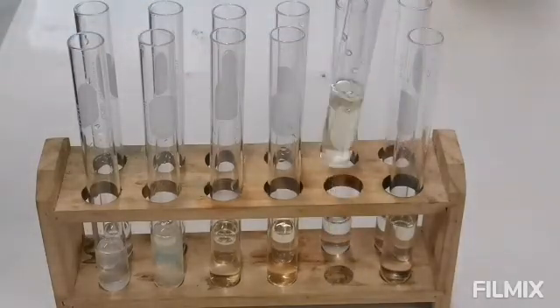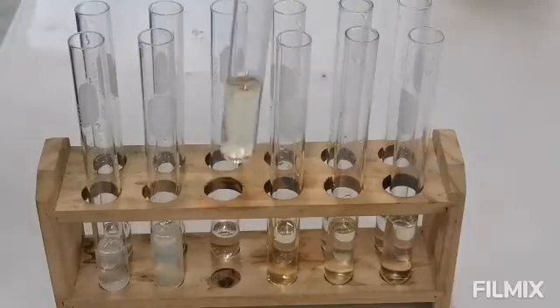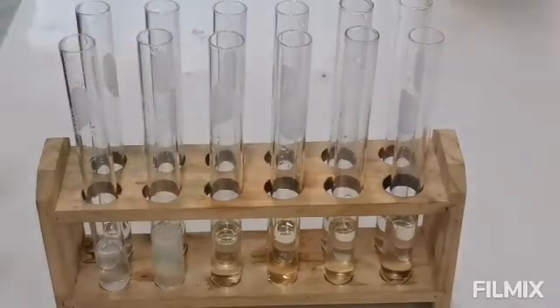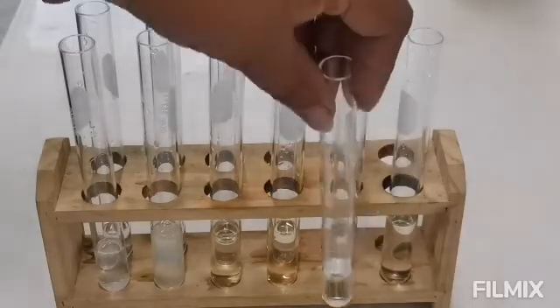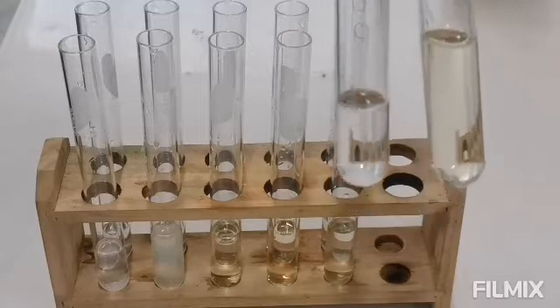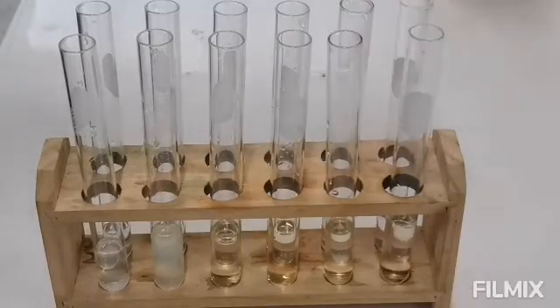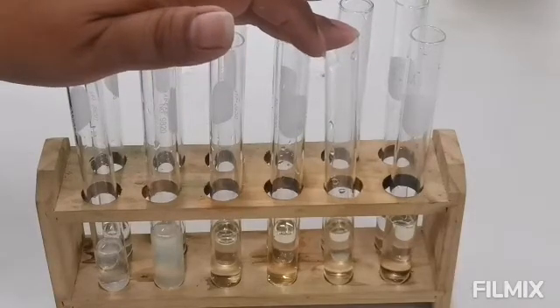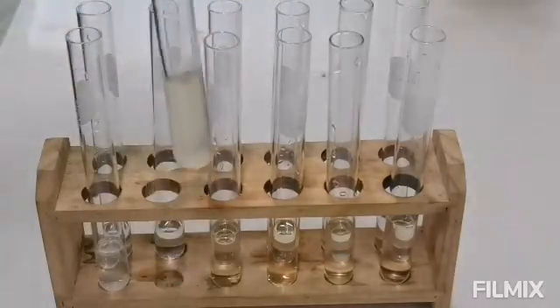So there are the possible reactions that you could see. Okay. Please take note of the change of color. Originally, this is the color for your sodium hydroxide as compared with after the addition of your beef extract. So you could make your observation now. So this is your sodium hydroxide. This is for your sodium hydrogen carbonate. This is for your citric acid, and this is for your ethyl alcohol.